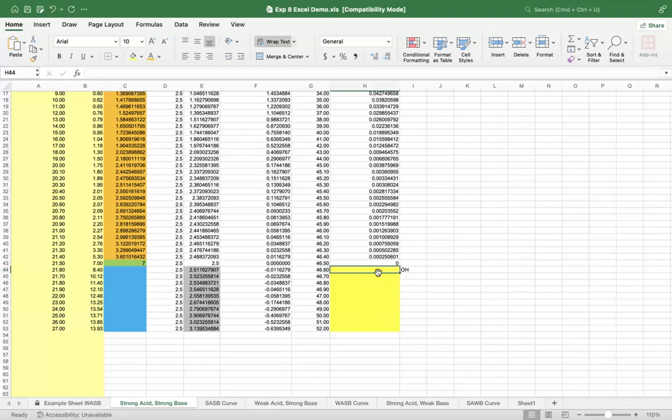So hydroxide. Now, how do we find out how much hydroxide is present? Well, the hydroxide that's present is equal to the moles of the excess hydroxide that we added, divided by the volume. We actually have these numbers, all these negatives right here. This is how much more moles of base there are than acid. This is the excess of that hydroxide. What we want, though, is not a negative number. I suppose it really doesn't matter. We don't need to change them to be positive numbers.